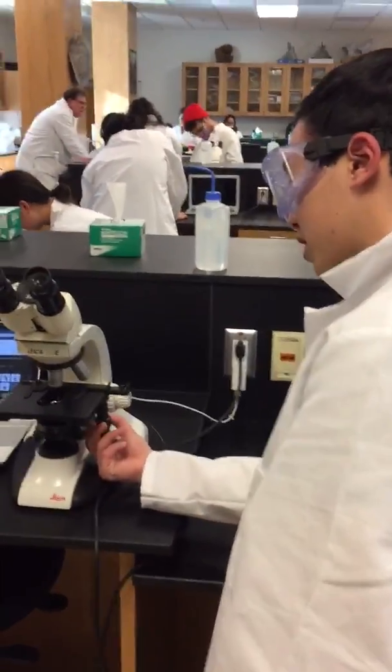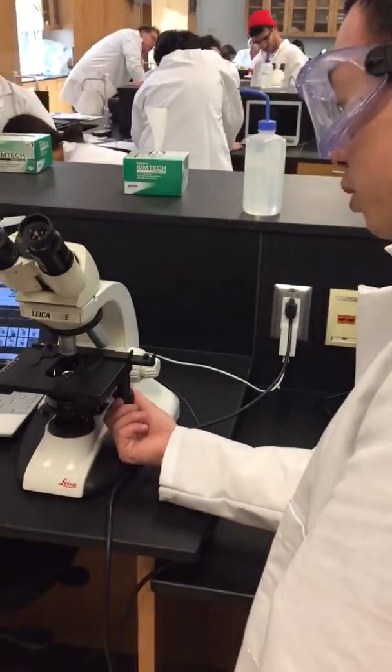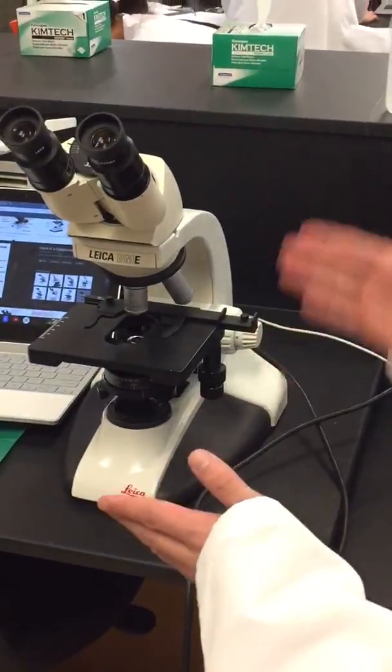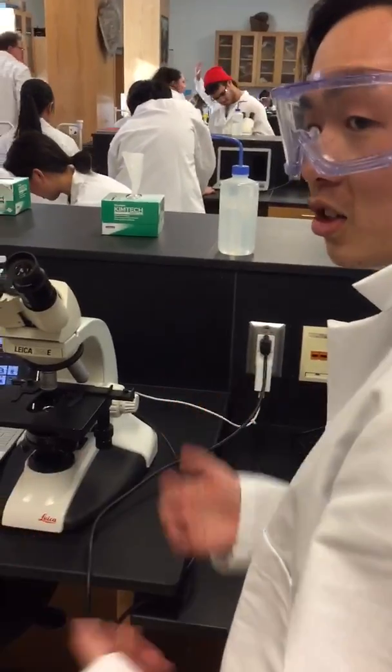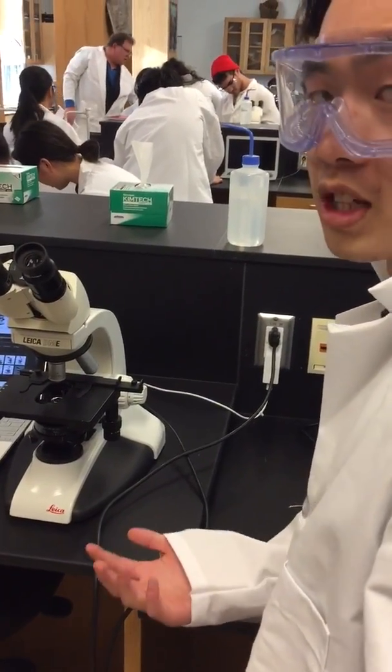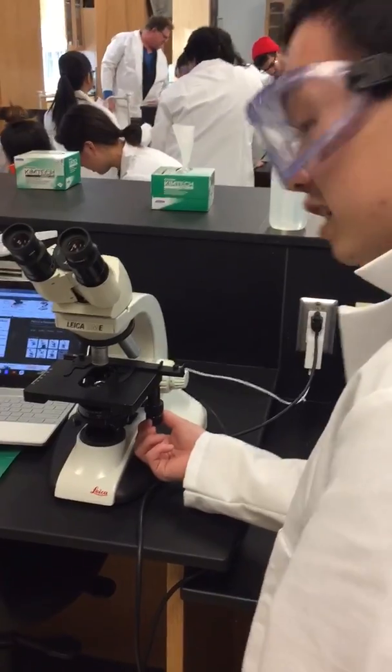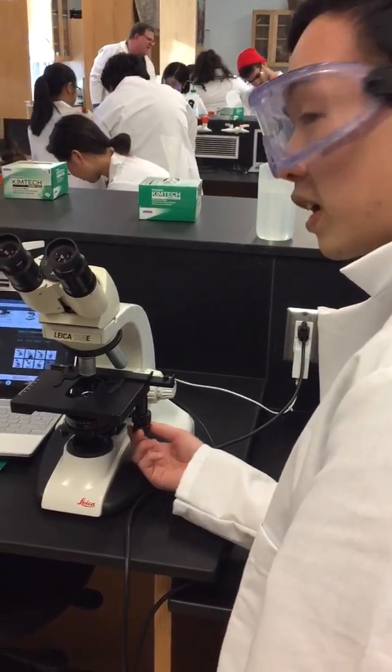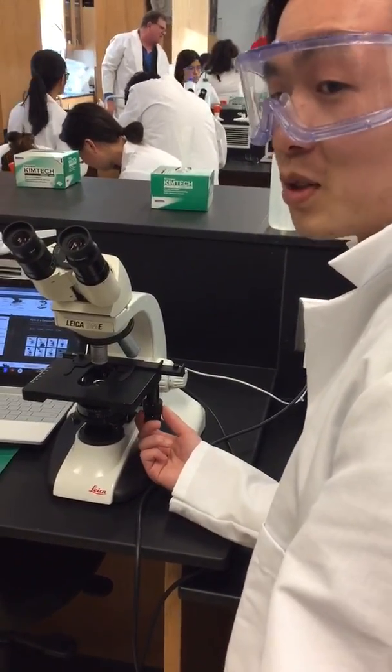The top knob here moves the sample back and forth so you could adjust and look for certain microbes within your specimen, and this bottom knob here moves it left to right which also helps you look for your specimen.